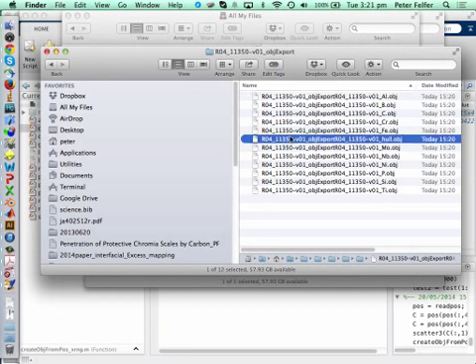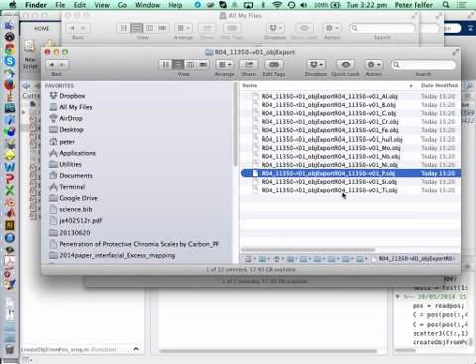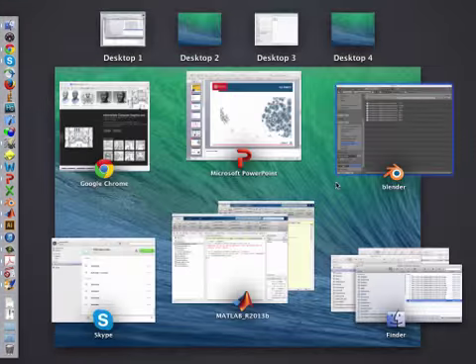And you've got one that's special, and that's the hull of the data set. The hull of the data set is the so-called alpha hull or concave hull of the data set, which means it's sort of the hull that you would get if you used spheres, in this case I've set it to have a radius of 5 nanometers, that were tightly fitted to your data set. Having the boundary of the data set is a very, very important thing when I do analysis. And the rest is just simply the different atomic species.